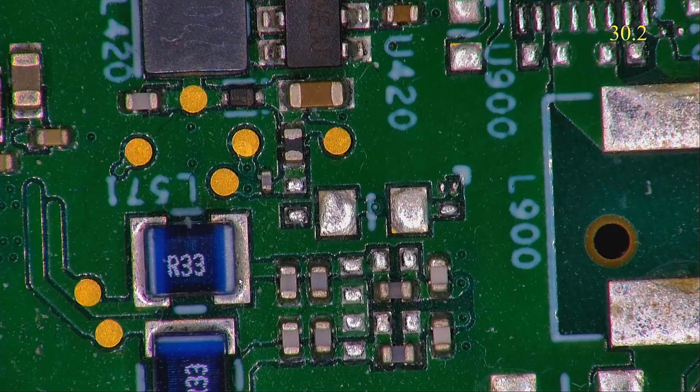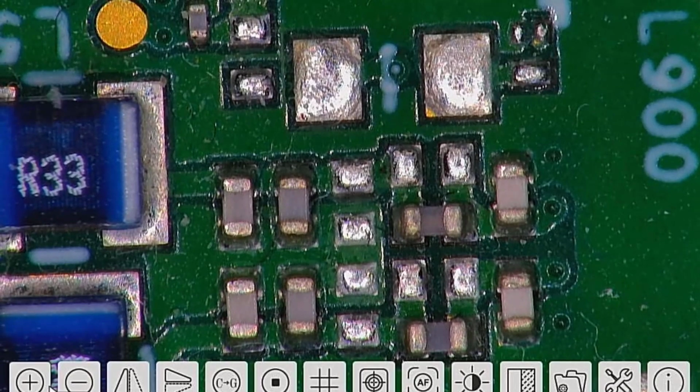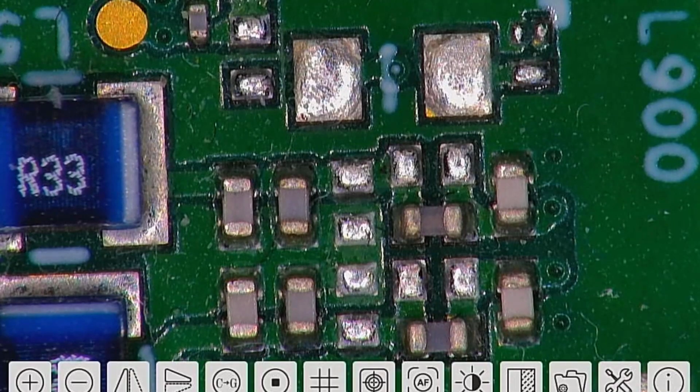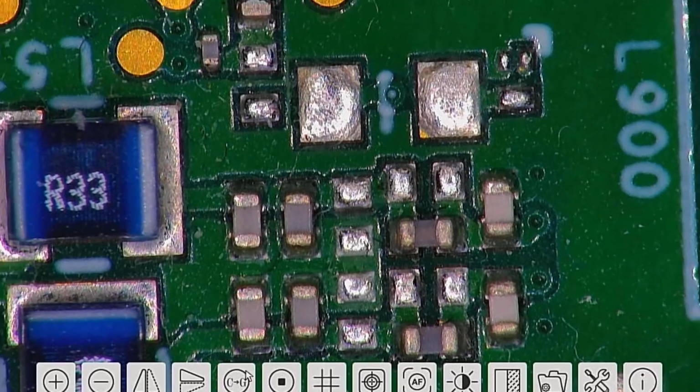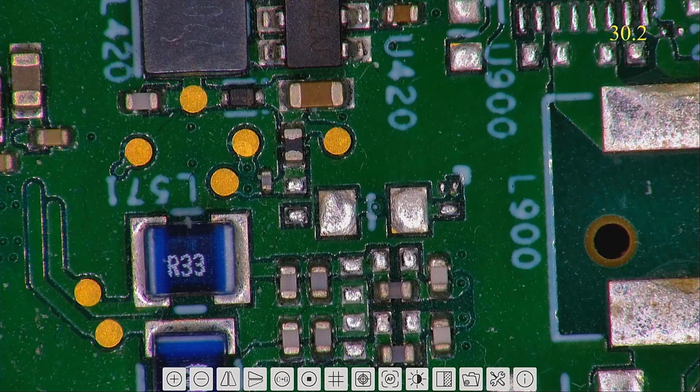Right now we are going to look at the secondary camera control panel menu, or the features menu. You access the menu by bringing your mouse cursor to the bottom of the screen. This can only be accessed while you have your All-One camera connected directly to a monitor via an HDMI cable and while you have a wired or wireless mouse connected to the USB mouse port on the back of the camera. There is no pin for this menu as it is mostly a secondary feature to the camera.